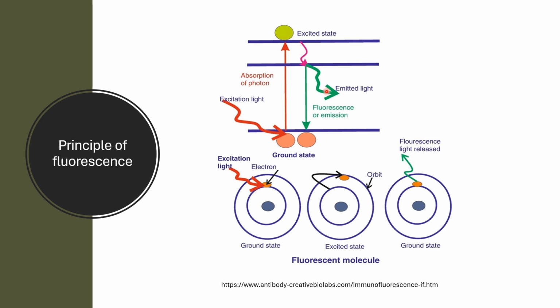The fluorochrome markers are detected with a fluorescence microscope equipped with a mercury vapor or xenon light source and appropriate filters, the excitation and barrier filters. The exciter filter serves to shed the light of necessary wavelengths on the examined slide, while the barrier filter stops the exciting photons, letting through only the fluorescent light.